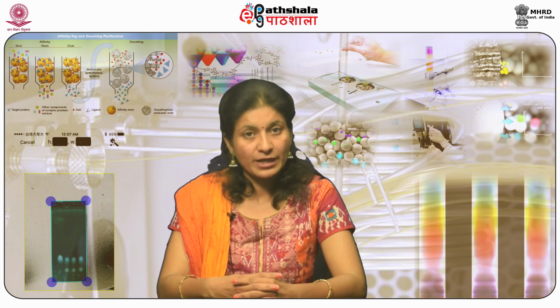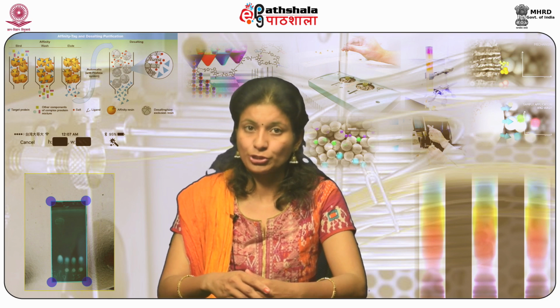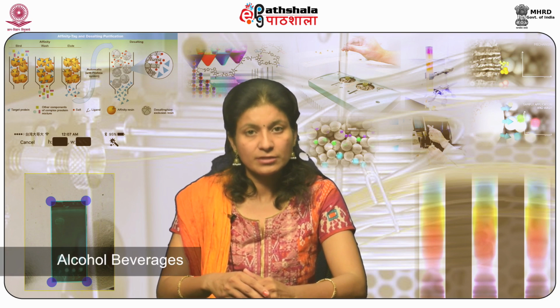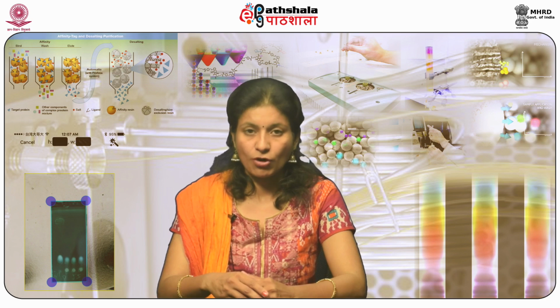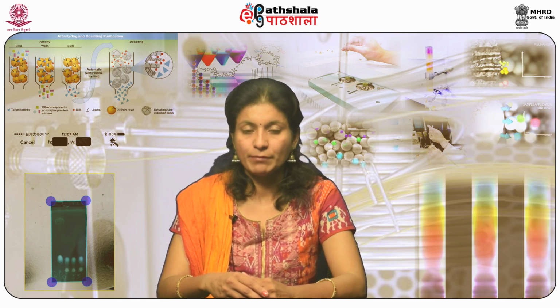In food flavors and fragrances, there are a few other examples, that is, monitoring legislation for food products, formulation of controlled diets, controlling the formulation during product development, detecting the changes in food during storage and processing, analysis of alcohol beverages, analysis of various solvents in food preparation, analysis of dairy products such as milk, butter, cheese, etc.